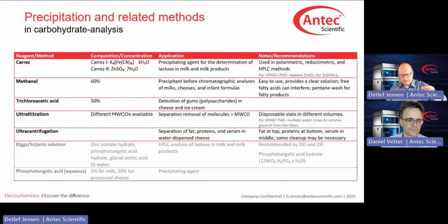And the different approaches are listed in the table, reflecting the frequency you find these sample preparations in the food and beverage arena.